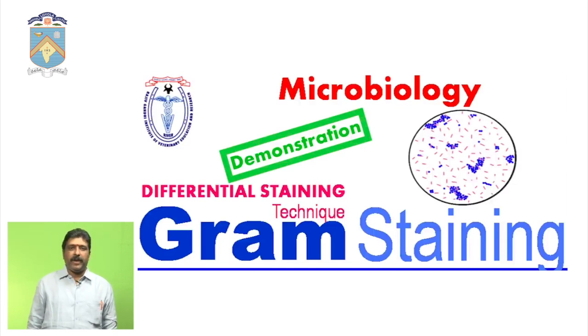Let us know about the different shapes of bacteria. Bacteria exist in different shapes like cocci and bacilli, like streptococci and lactobacilli. Those are the shapes of bacteria. To know about the morphology of bacteria, the staining technique is one of the important tools in the microbiology laboratory. There are different types of staining techniques.